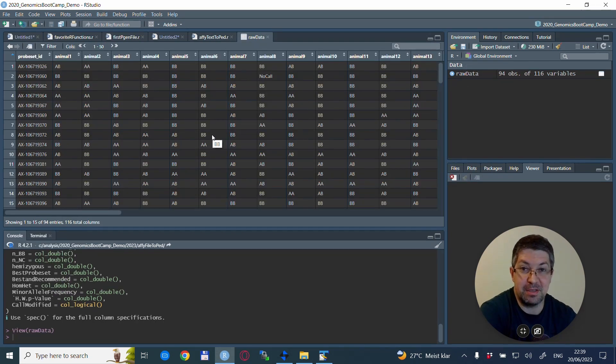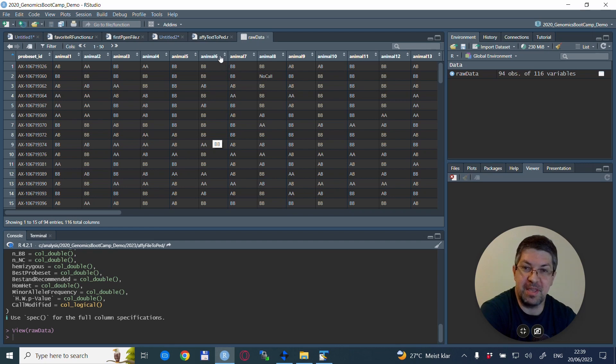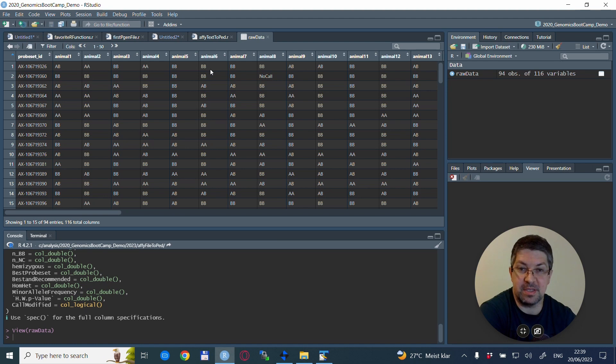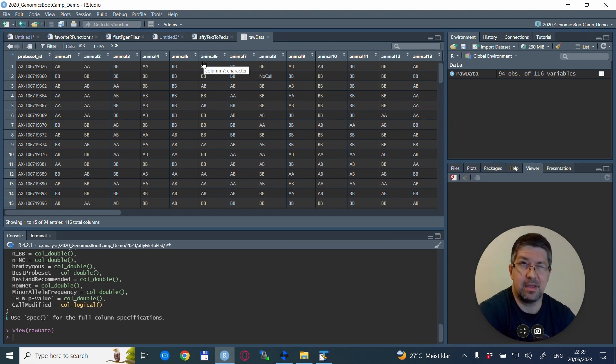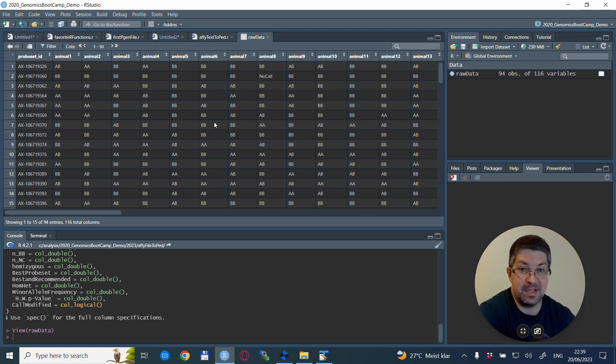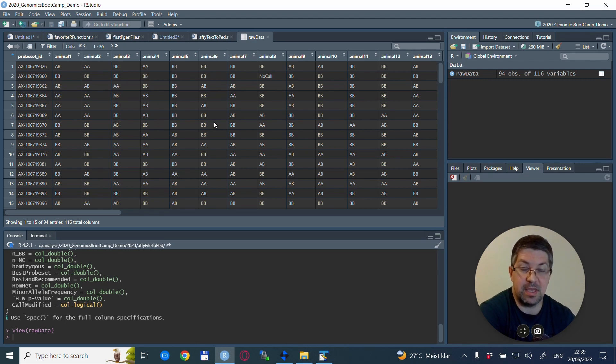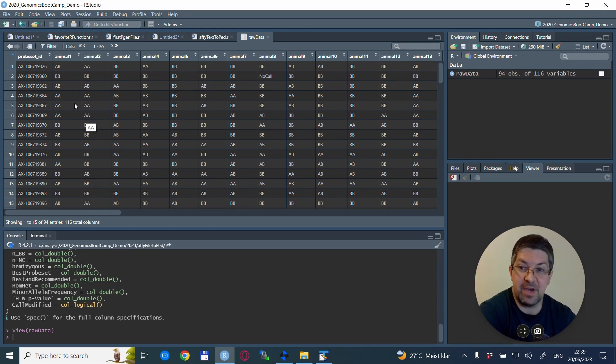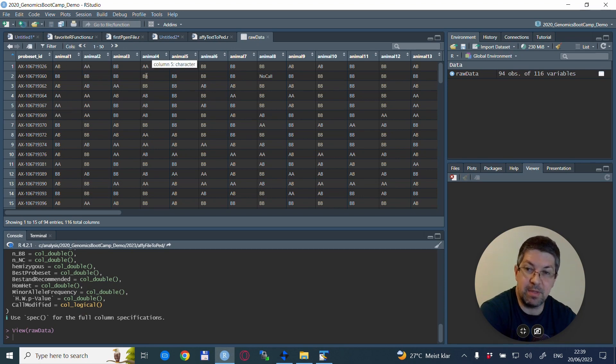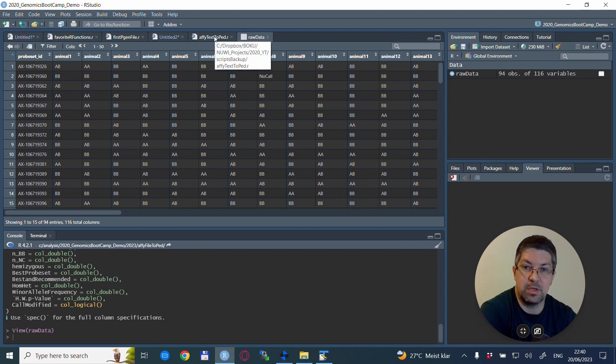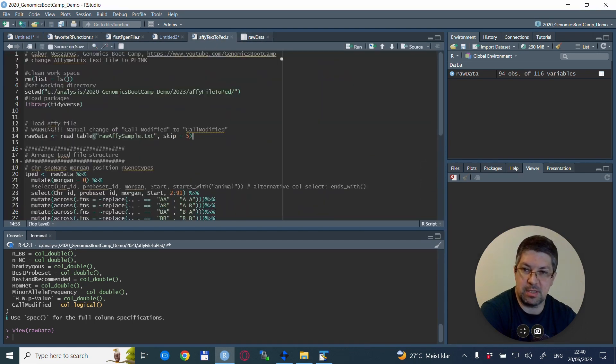And this is what we did—we read in this raw file into R. This is actually surprisingly quite close already to a plink file, a very specific plink file, mind you. It is a so-called tped file. So you might remember there is a very classical file that is the ped file, that has as many lines as many individuals you have.